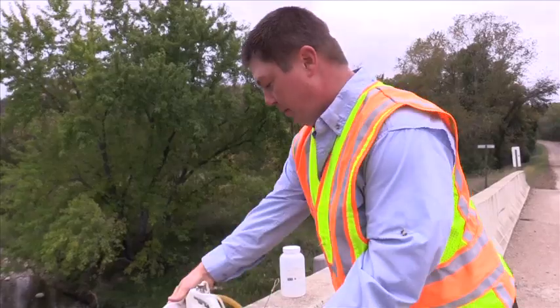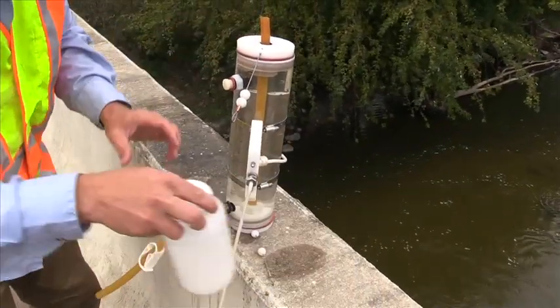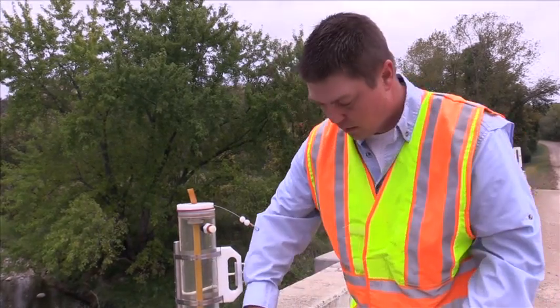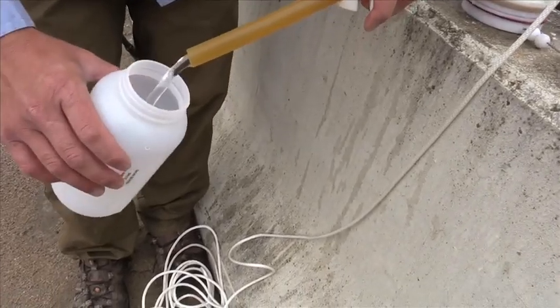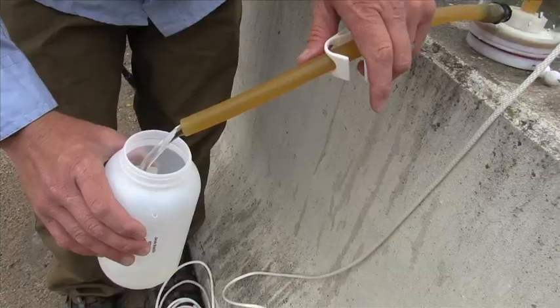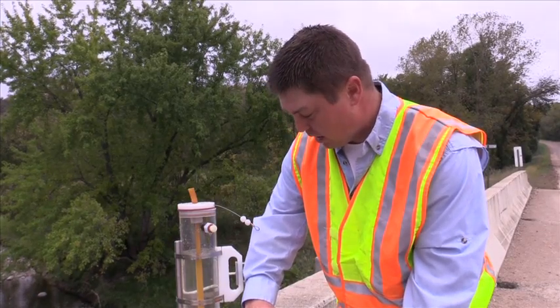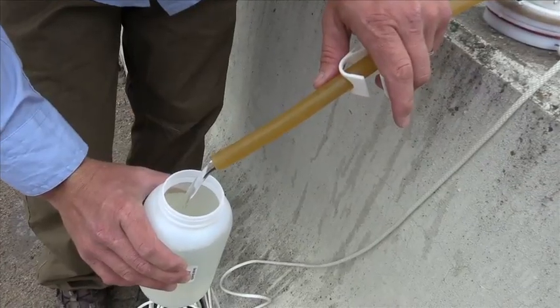Once we have the sampler back up on top of the bridge, set it upright, take our bottle, loosen the clamp, and get a steady stream of water flowing. Fill your bottle, and make note to watch the sampler and make sure that there isn't too much sediment settling out in the sampler itself.